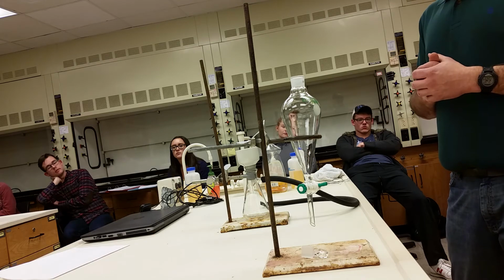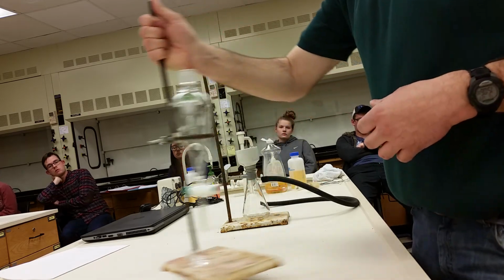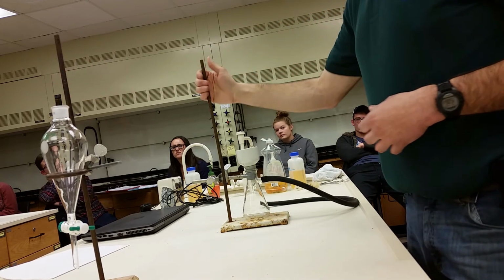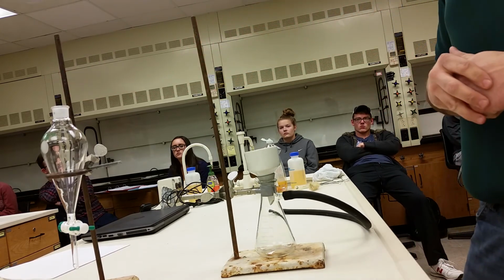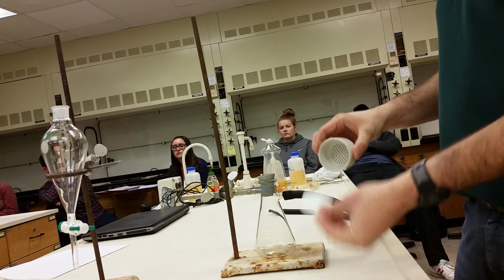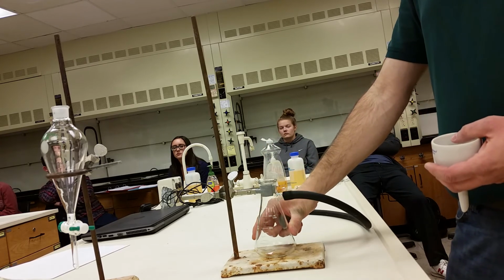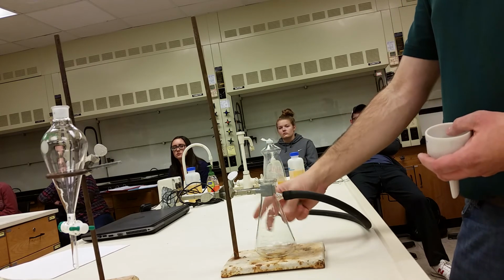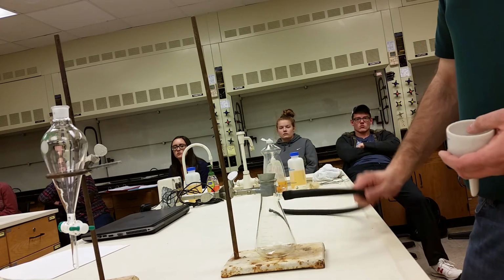Once no more solid precipitate forms from either the bicarbonate or the sodium hydroxide or both, you then need to filter. You're going to do that by using this setup here. This is your filter setup. You have a Buchner funnel with a piece of filter paper, a rubber gasket, a vacuum flask, which is a sidearm flask, and a tube.